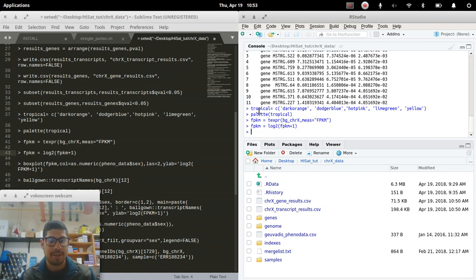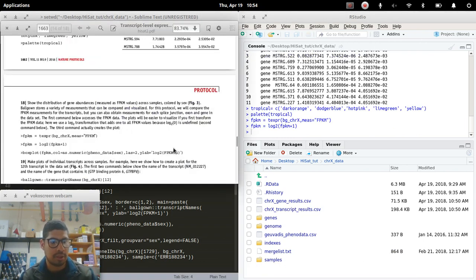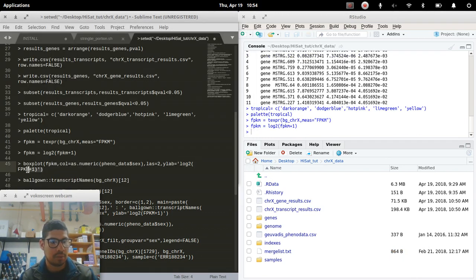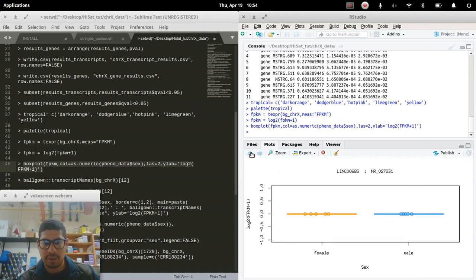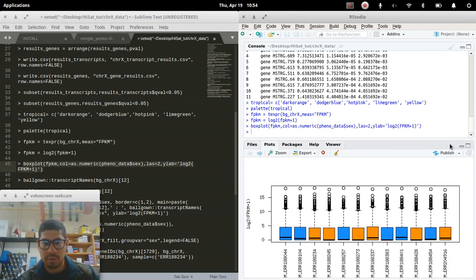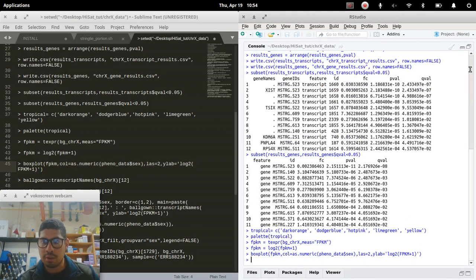So our next step is putting this on the box plot. So we'll do this, and we get, let's see if we can find it. It should be this data right here. We'll enlarge those and show them a little bit later. Let's split the screen for now.